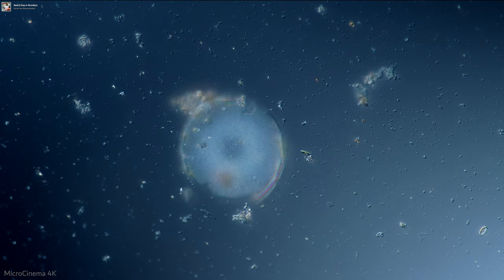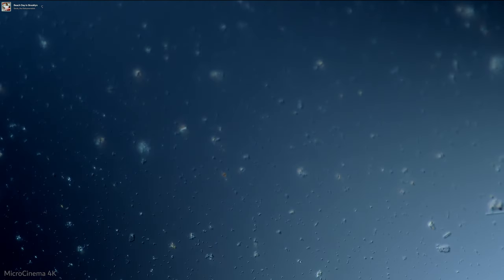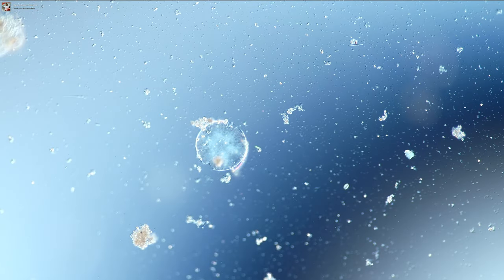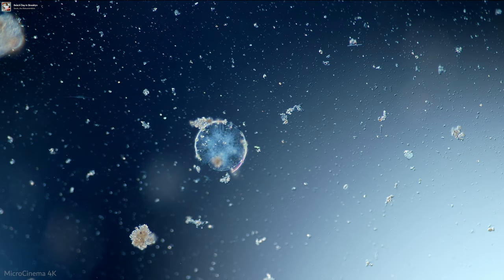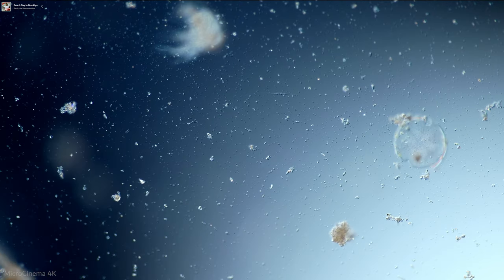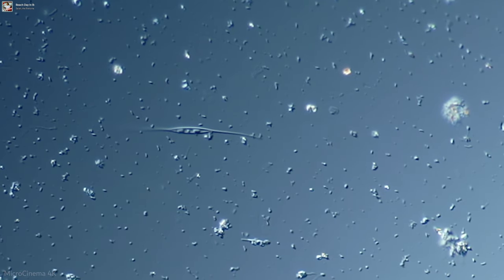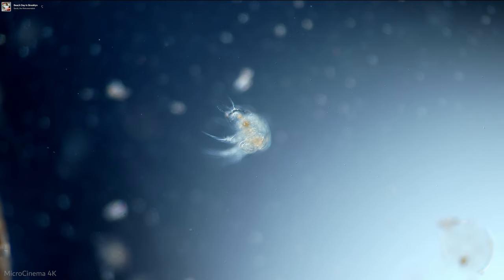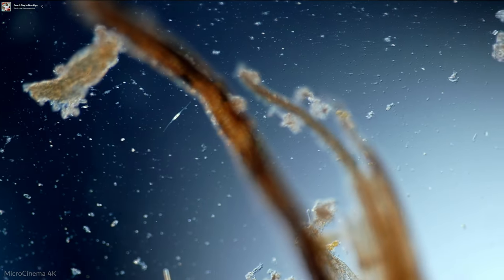Yeah, Coscinodiscus, the frustules are just so perfect. I have another slide actually. I posted a picture on the Discord and on Reddit of an arrangement slide with a bunch of Coscinodiscids on it. And there's another little planktonic diatom there, very small. And then this is another one of our little plankton buddies that didn't make it. They're a lot cooler when they're swimming around and kicking and whatnot.